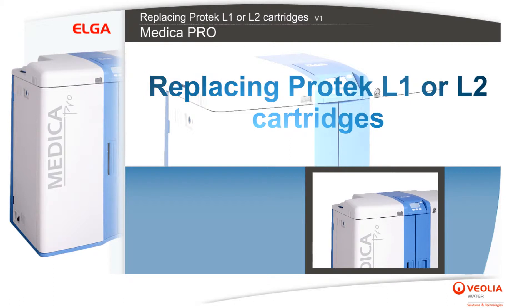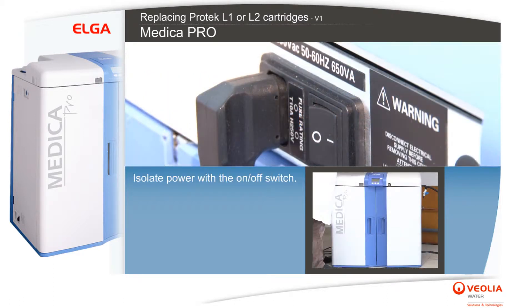Replacing Protek L1 or L2 cartridges. Isolate power with the on-off switch.